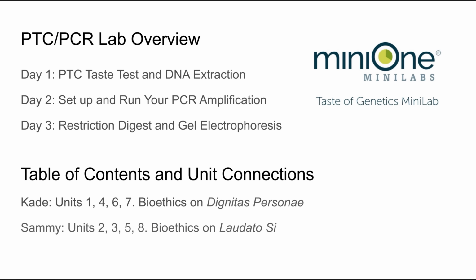A quick overview of our table of contents and the lab that we did a couple days ago. On the first day of the lab, we did a PTC taste test, followed by DNA extraction. Day 2, we set up and ran our PCR amplification. And then on day 3, we saw restriction digest and we performed gel electrophoresis.